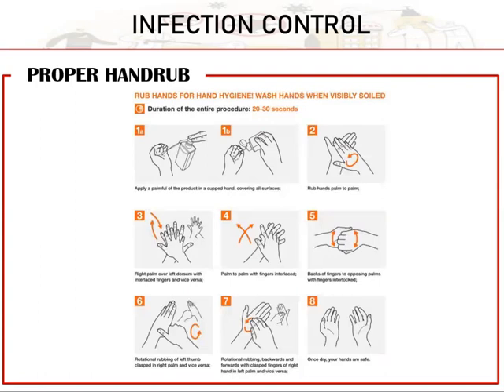Okay, so if hand washing with soap and water is not available, the ideal alternative is to disinfect your hands using a hand sanitizer. So, acceptable po ni siya, class, if your hands are not visibly soiled. Okay, nang dili kaayo, walay blood stain. You just want to disinfect your hands. So, this is an ideal alternative.